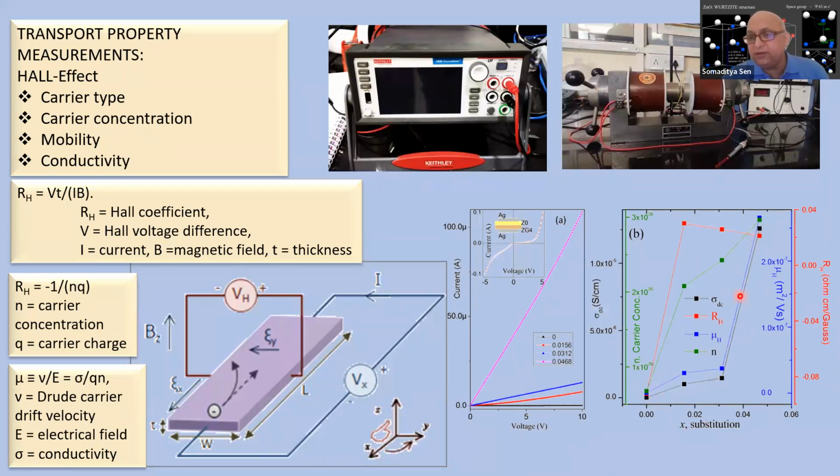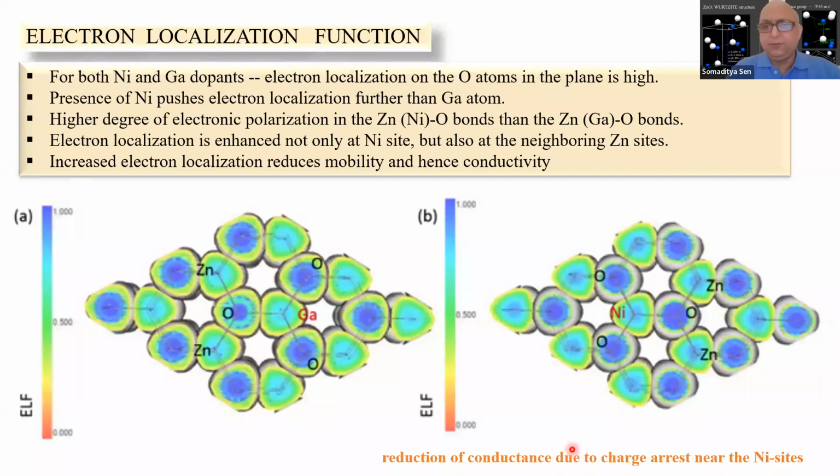That is, the DC conductivity has changed. It has improved drastically, actually, and also the mobility factor has improved drastically in this 4.5% gallium doped zinc oxide. Okay, so it is a very important study, and it is needed for all materials that we prepare in our lab.